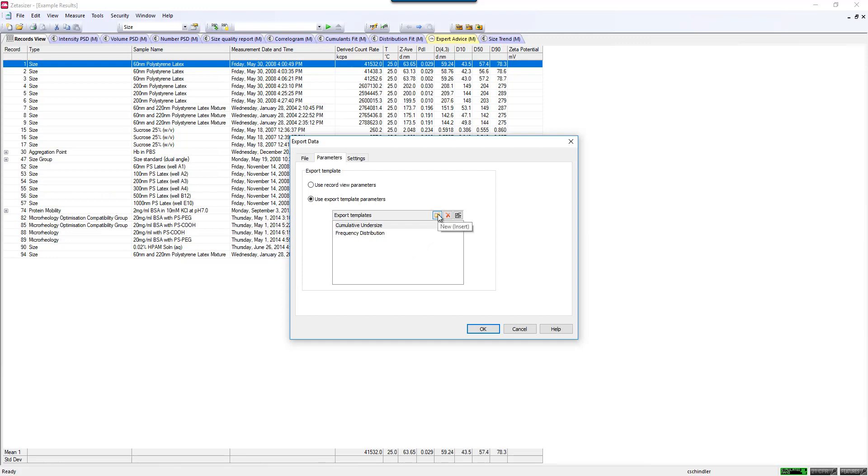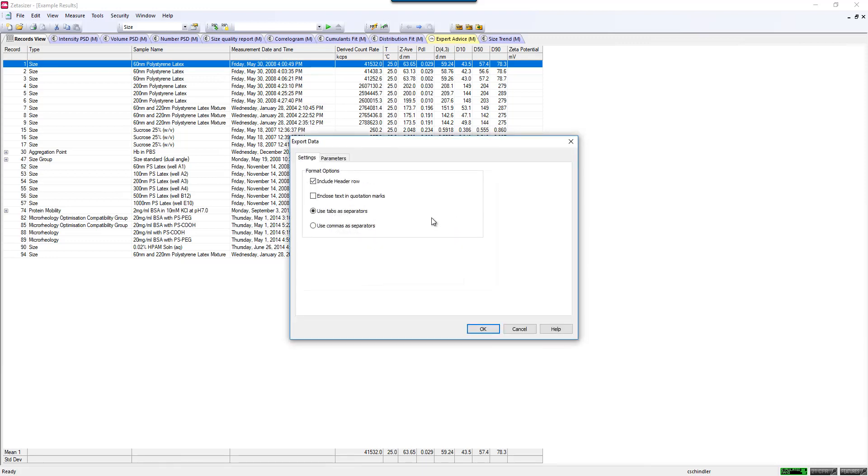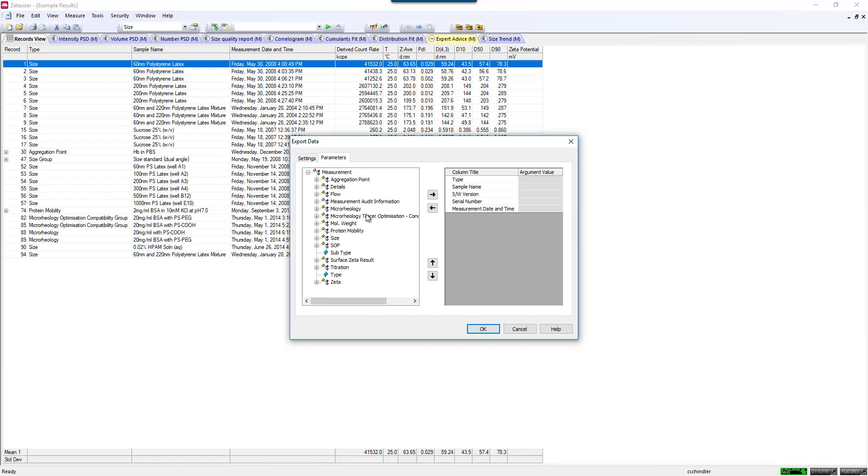To do that, you can click New and give that a name. Maybe this is for sizing or something. Give that a name and then go to Edit. This is where you would decide how you would like the data file to be formatted and what parameters you would like to export.